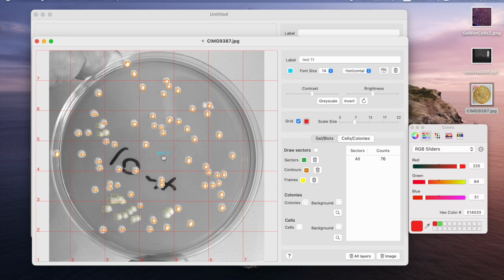If we just click and drag, then we can change the position. Again, just double click to remove the text. If we would like to have bigger letters and a different color, a red one, then again press, click and drag, and then we have our image.